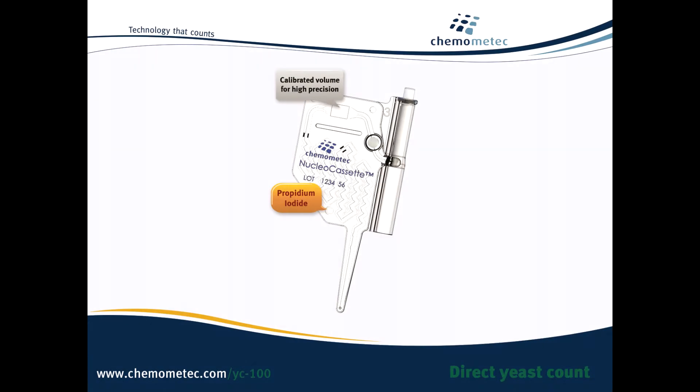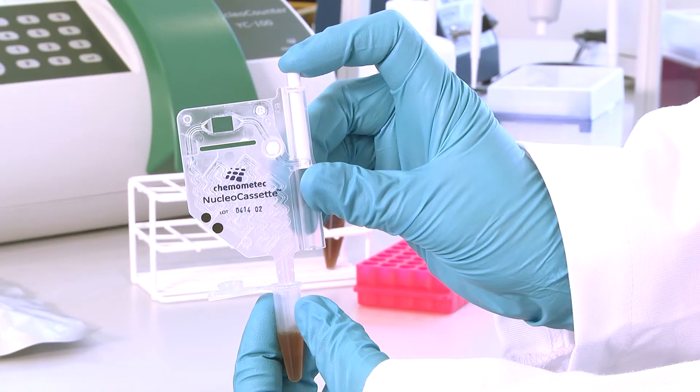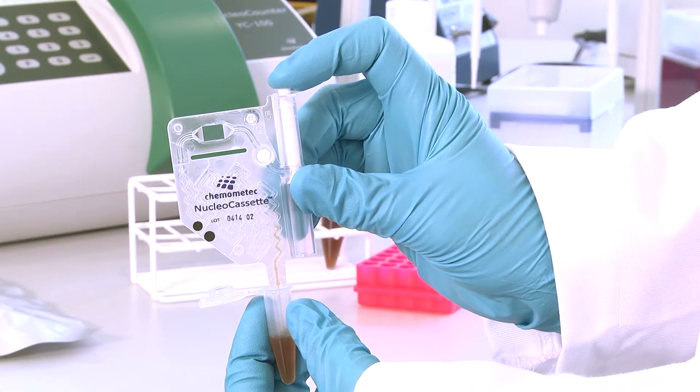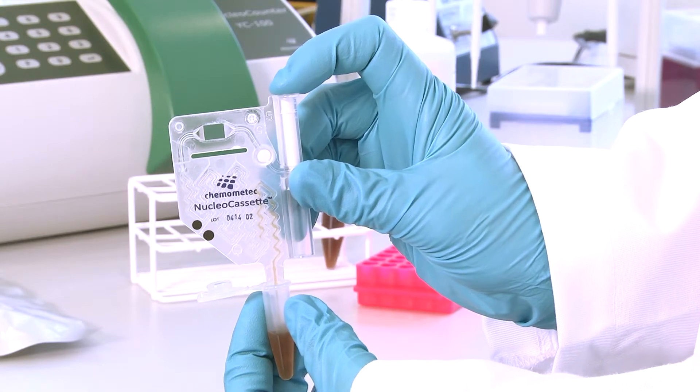The secret is the nucleocassette. It contains the dye that stains the DNA of the yeast cells. The volume is pre-calibrated, eliminating human subjectivity, and everything is self-contained so there is no exposure to hazardous materials.